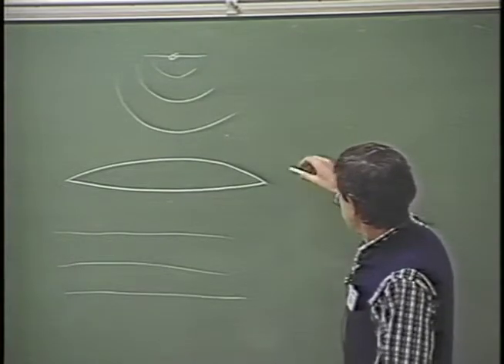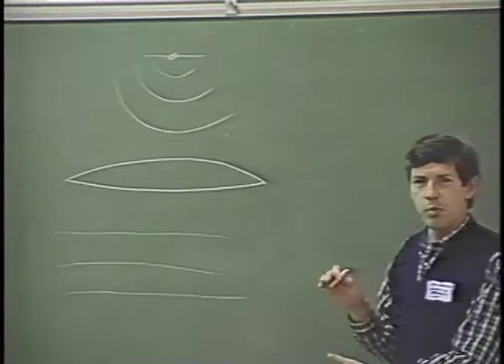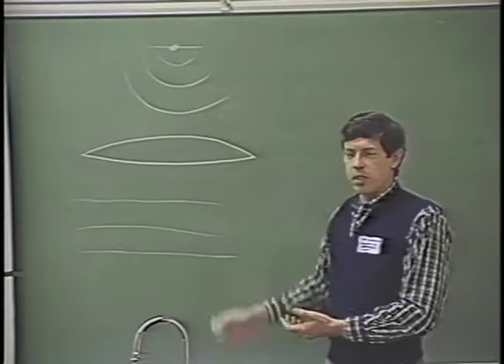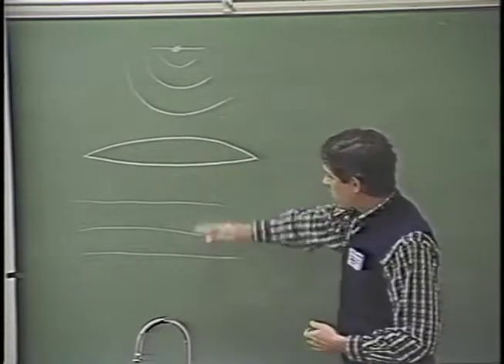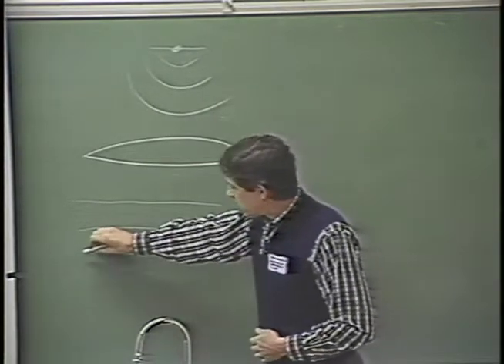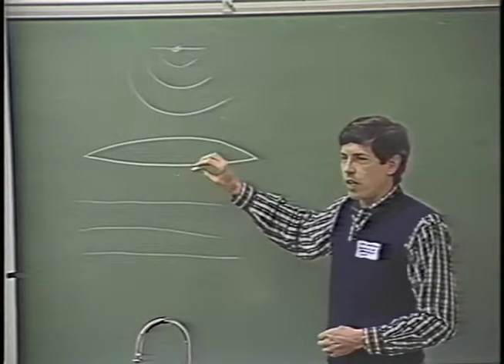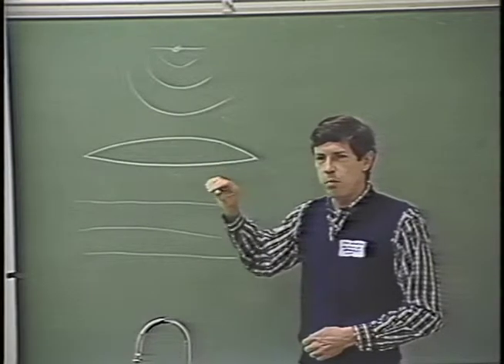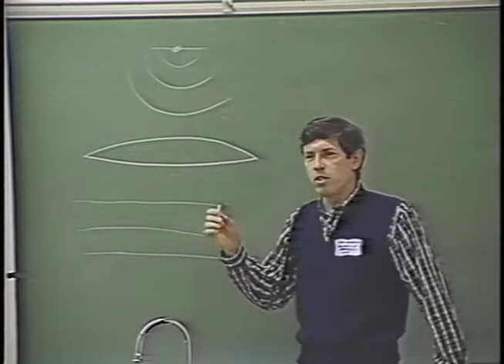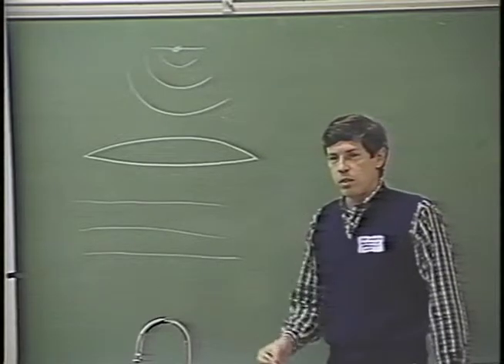So you'd have a plane wave propagating down from the objective lens. Now, if this specimen is in the front focal plane, and it is approximately in the front focal plane of the objective lens because the lens is run at a fairly high magnification, in the back focal plane where you have the electron diffraction pattern, this plane wave serves as quite a good reference. Now, the actual objective lens is never quite perfect, and as Eileen pointed out, the best phase contrast images are obtained when you're not exactly in focus.